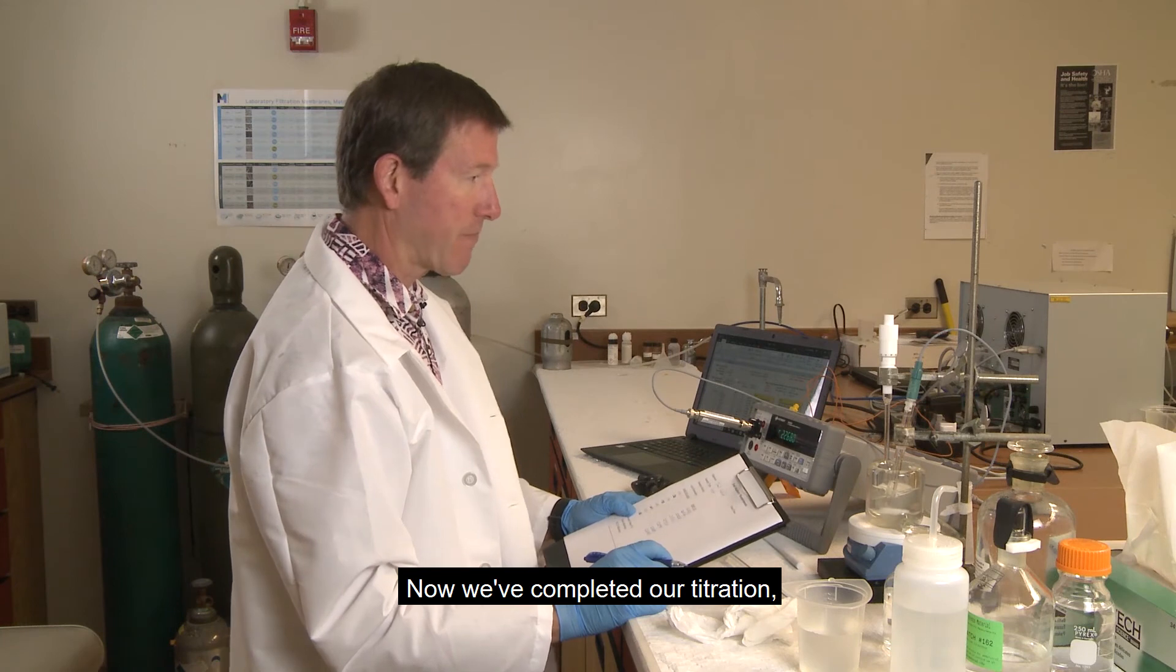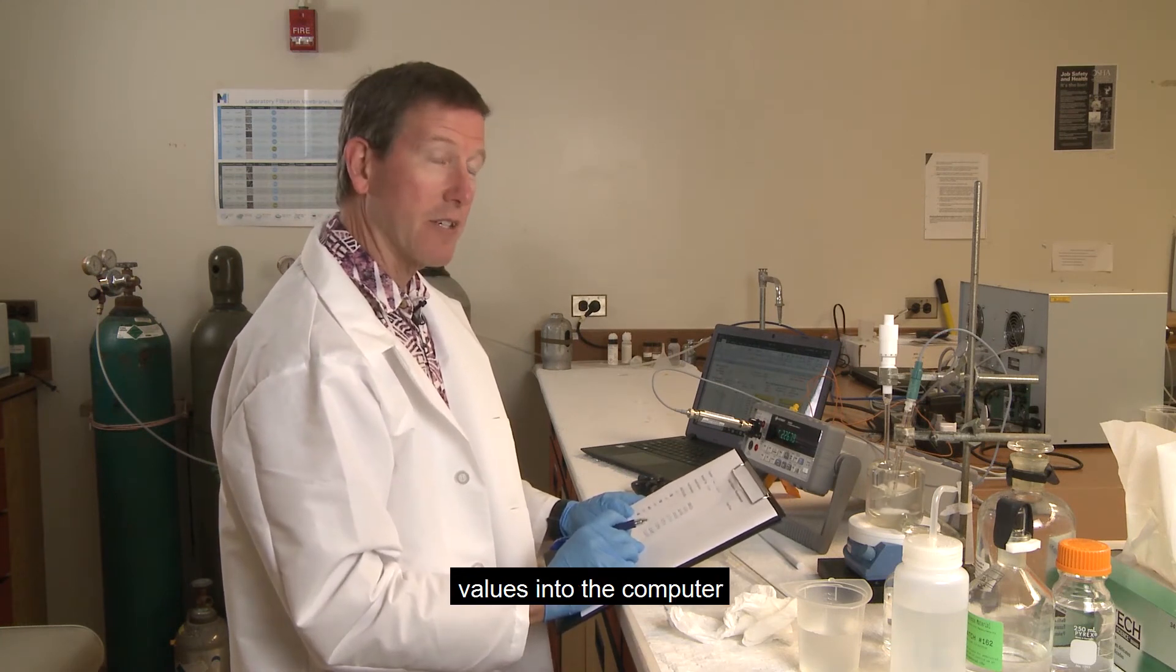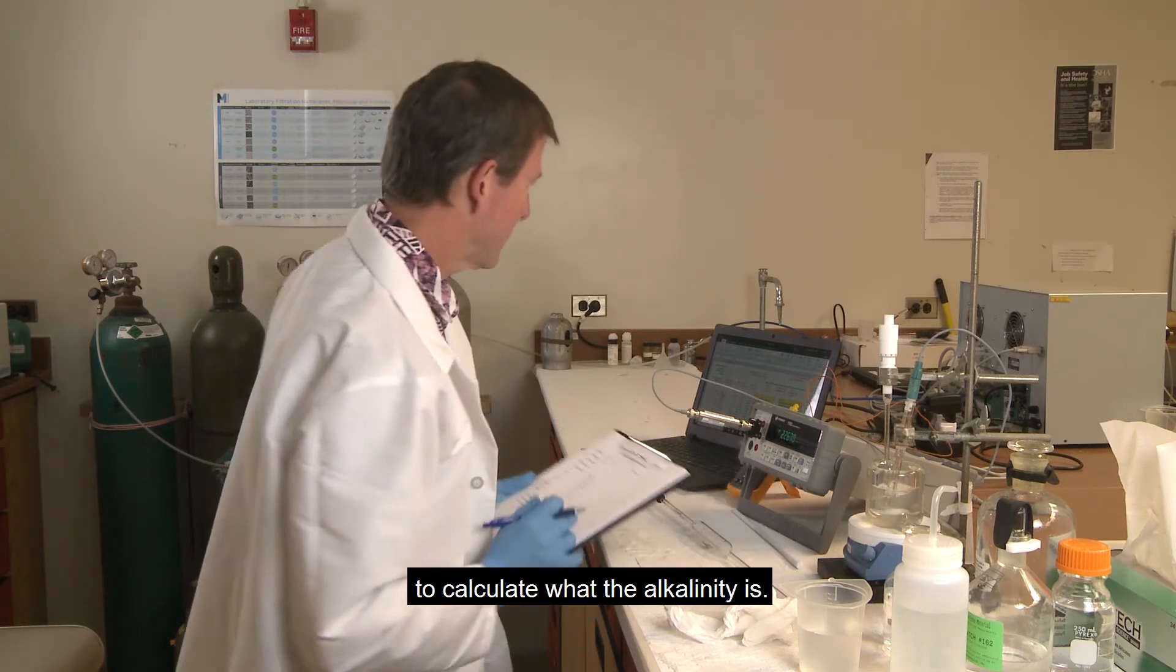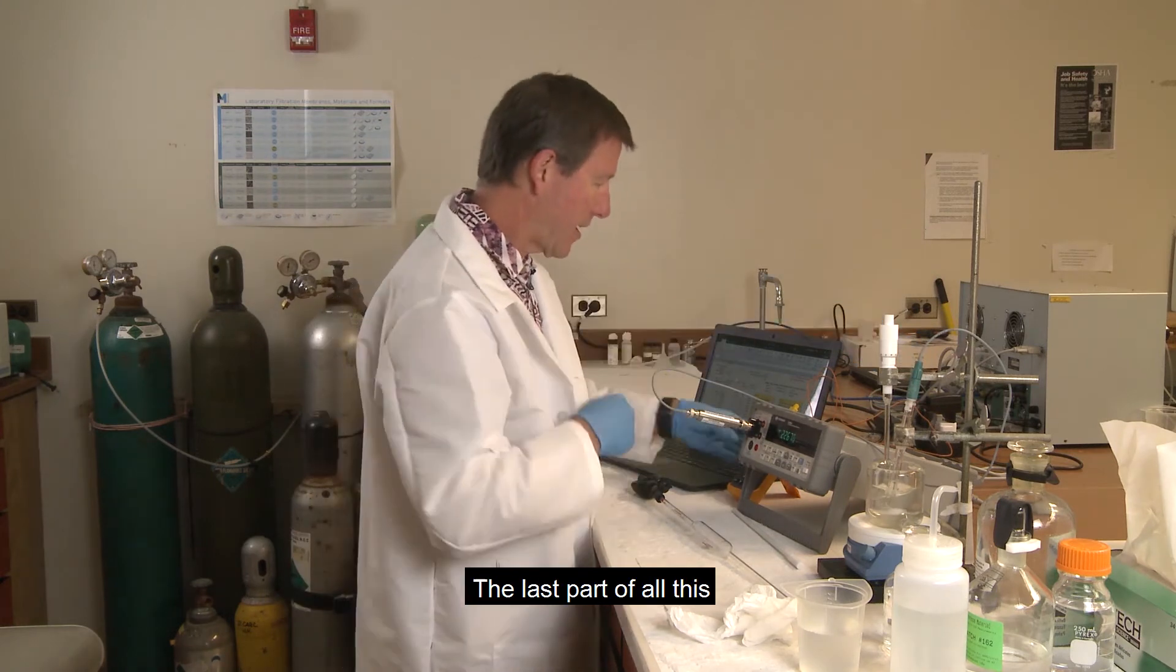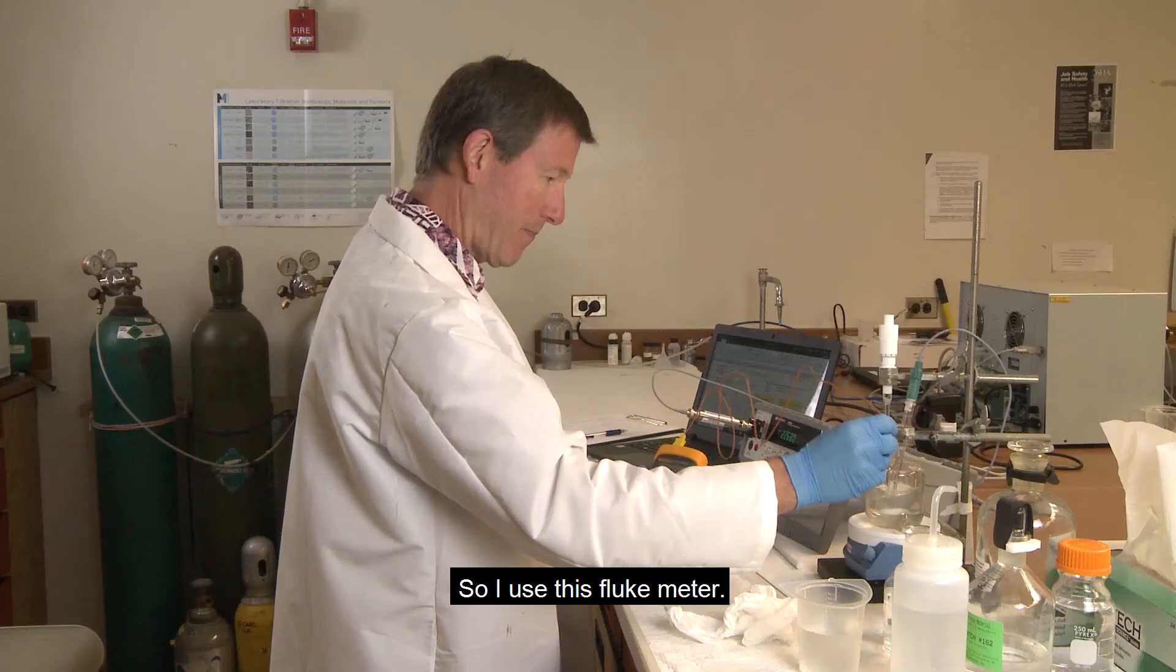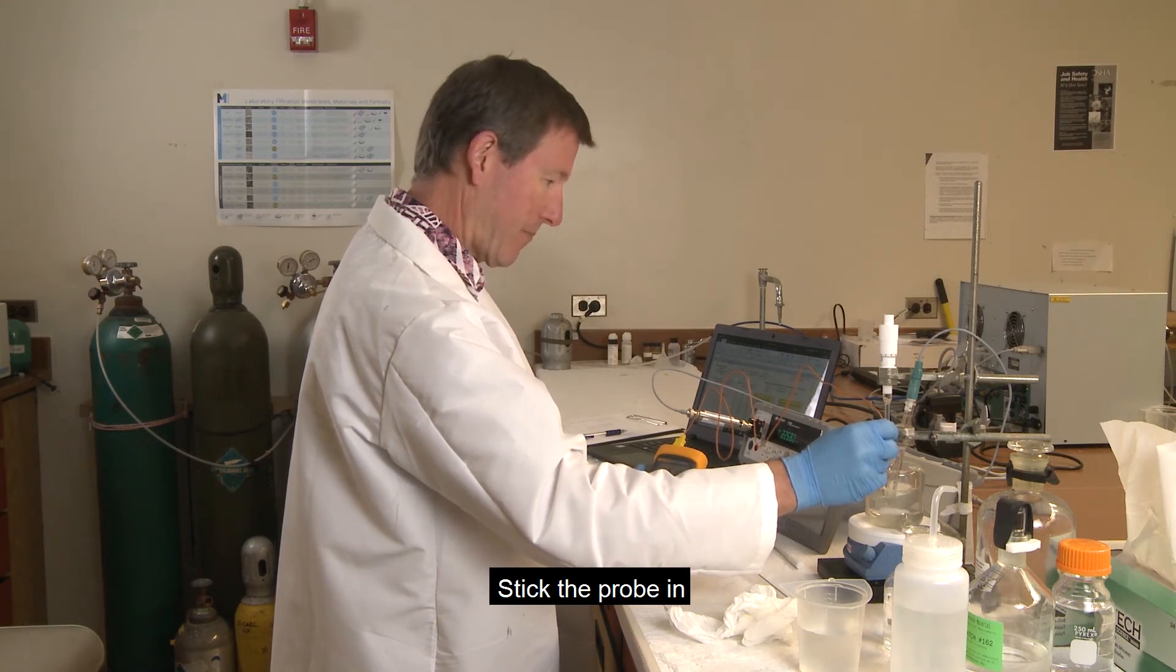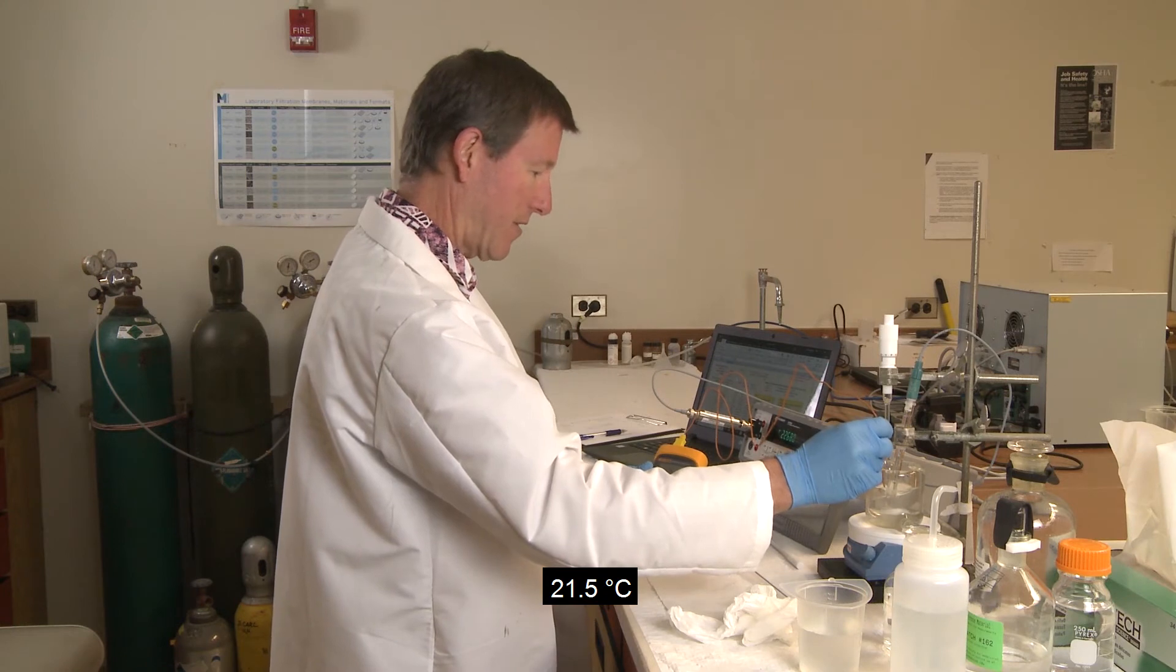Now we've completed our titration and we can enter these values into the computer to calculate what the alkalinity is. But one last thing before we do that. The last part of all this is you want to read the temperature. So I use this fluke meter, stick the probe in, and record the temperature, 21.5 degrees Celsius.